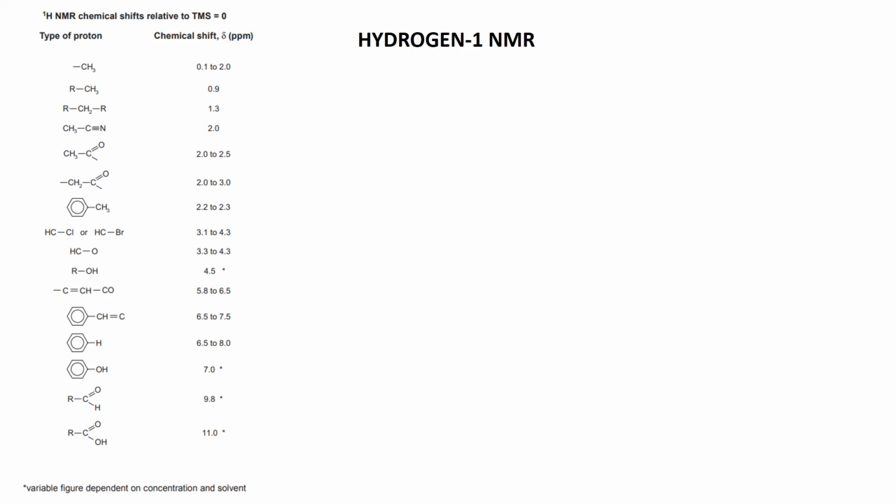Now, before I leap in and do lots and lots of examples of proton NMR, we do need to go a little bit deeper than we did for the carbon NMR because, again, we're not just looking at 1% of the nuclei, we're looking at 99% of the nuclei. Now, the spectrum on the previous page was what's called a low resolution spectrum. You might have noticed that the lines were rather broad, certainly compared to the carbon-13 spectra that we saw.